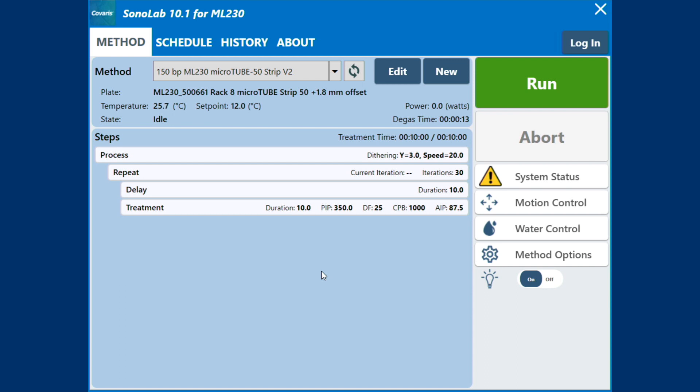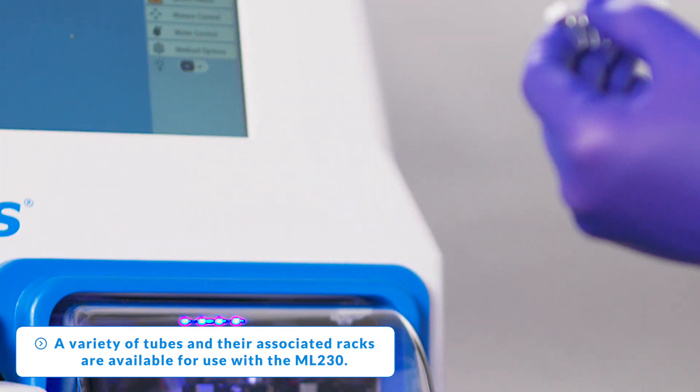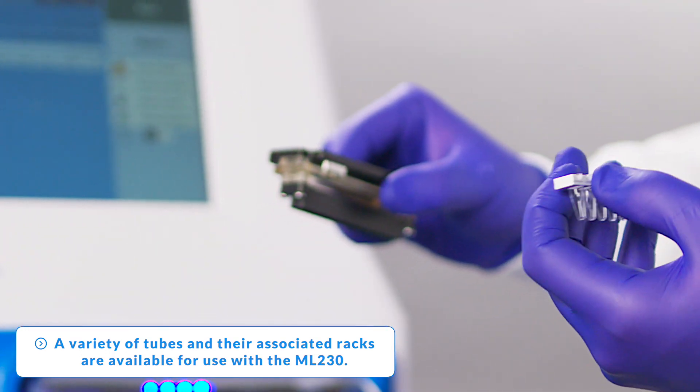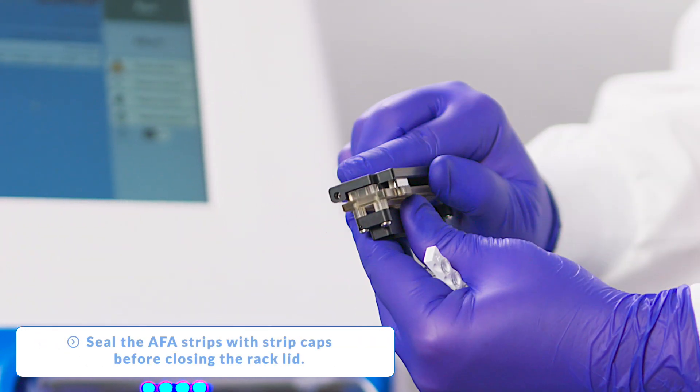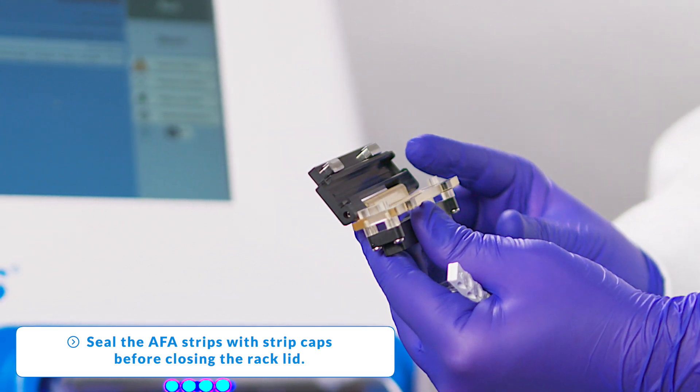Once a method has been selected, the proper rack and consumables must be in place on the ML230 sample tray. The AFA tube TPX strip, as an example, is fitted to its rack as a unit.